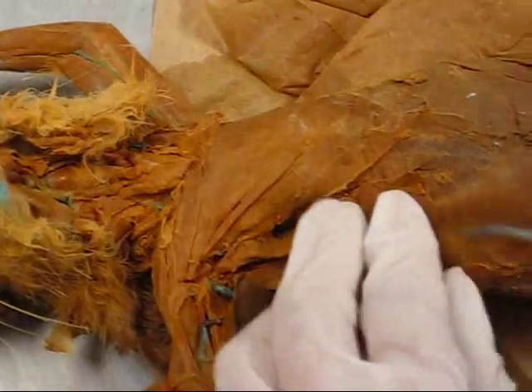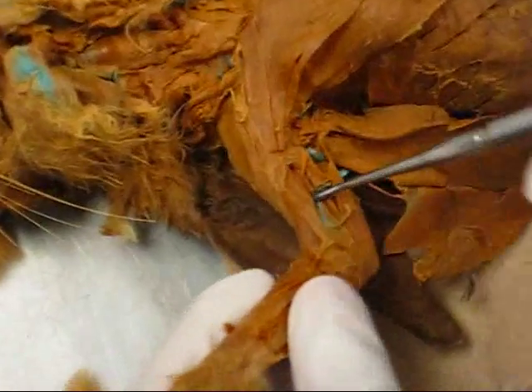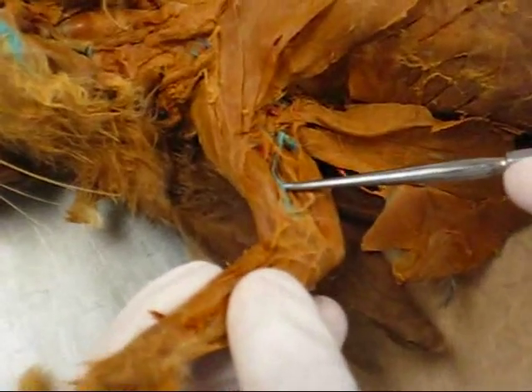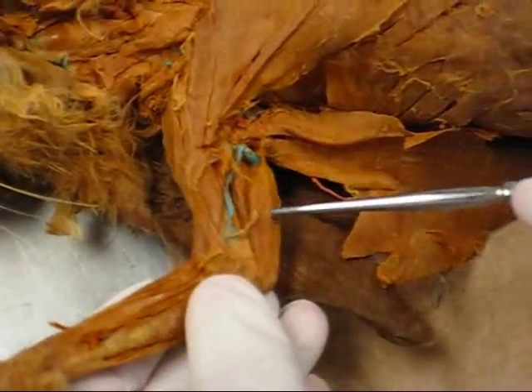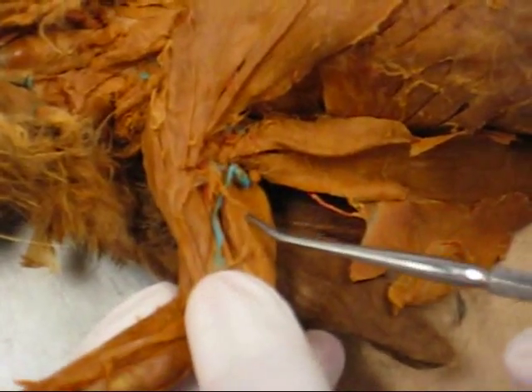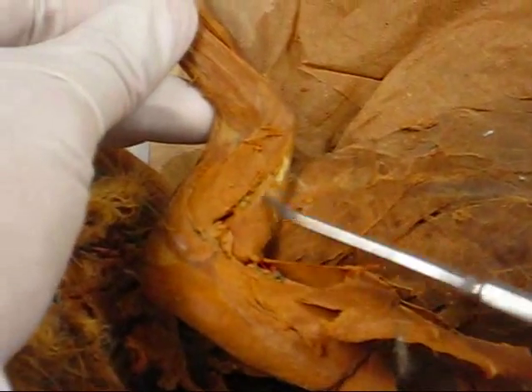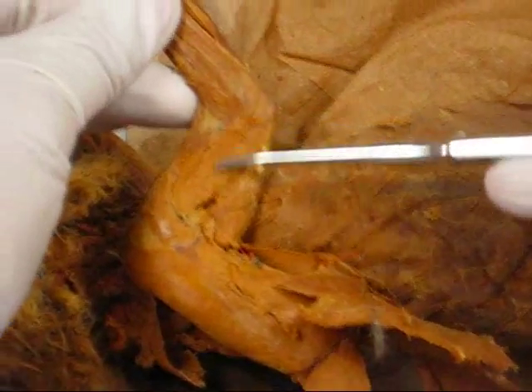Subscapularis, teres major, latissimus dorsi, biceps brachii, epitrochlearis. This is the lateral head of the triceps — also the lateral head of the triceps — and the long head of the triceps.